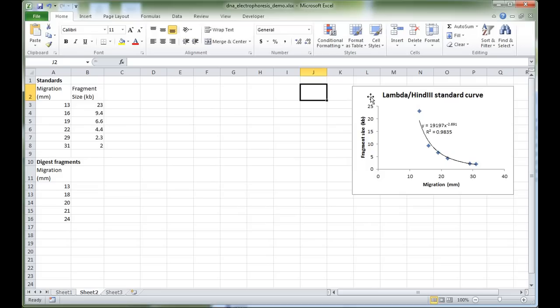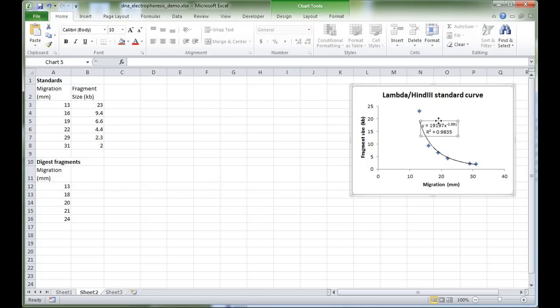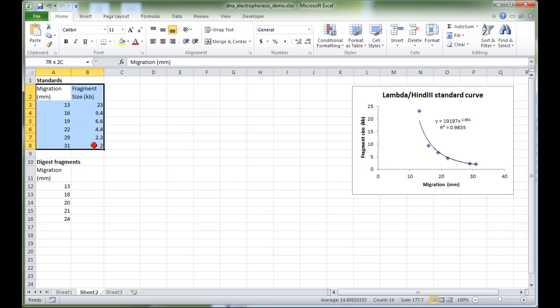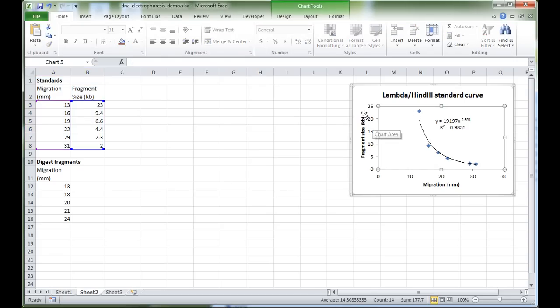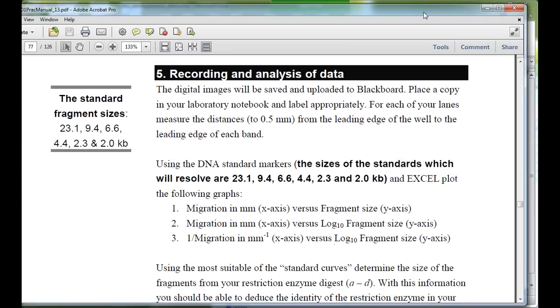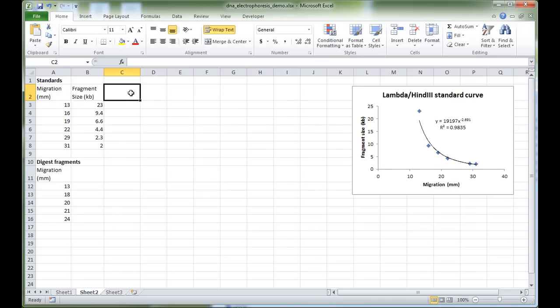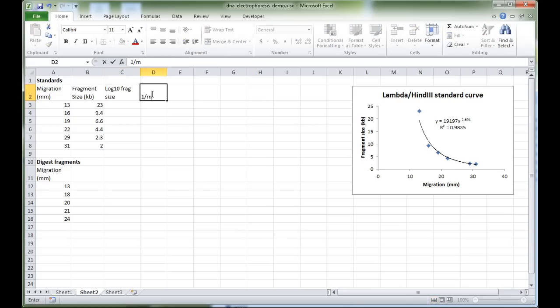From this standard curve we can see the mathematics isn't very clean. We can use Excel to mathematically transform the numbers to make the standard curve math easier. According to the lab manual, the second standard curve uses migration on the x-axis versus log₁₀ of the fragment size, and the third uses inverse migration versus log₁₀ fragment size. So we need to calculate log₁₀ fragment size and inverse migration — the inverse migration units are per millimeter.